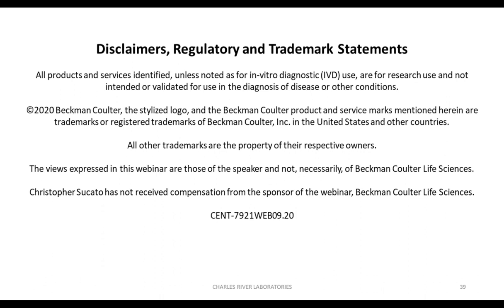Now, a method validation, as I've shown, involves many parts, many parameters are evaluated, and so there are many assays that comprise a full validation. For that reason, the amounts required there are much more, on the order of 5 milliliters at that same titer level of about 1e13.